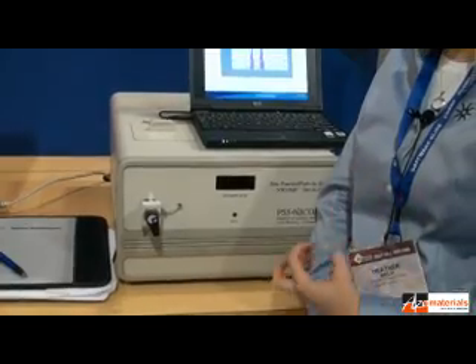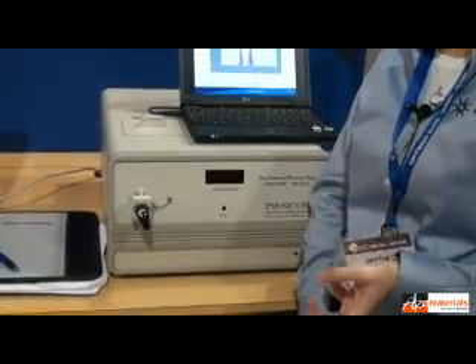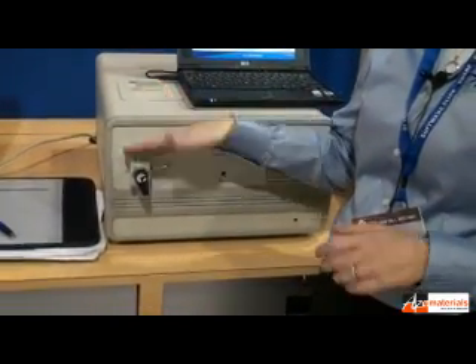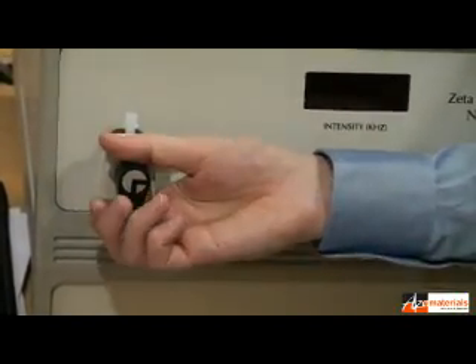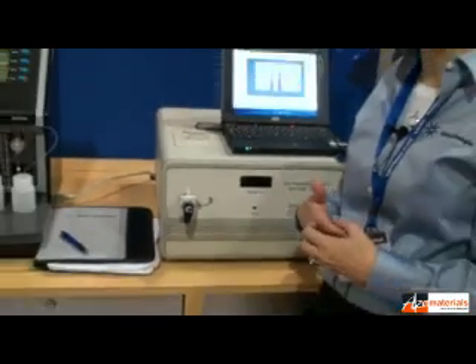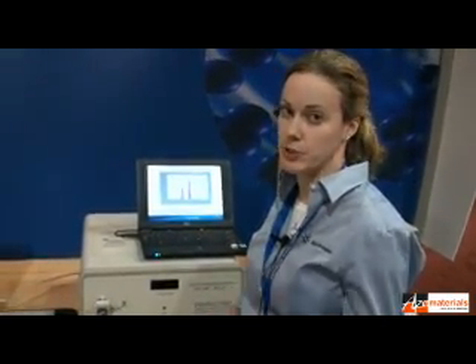There are two different ways to get your sample into the instrument. If you have a highly concentrated sample and you don't feel like doing the dilutions by hand, you can inject it through here into the syringe and have your diluent pump through — it will automatically dilute it down to the correct concentration. If you have a small amount of sample, this instrument can hold as minimal as 0.3 milliliters per sample, and in that case you'd use a drop-in cuvette. We have glass disposable cuvettes for that.